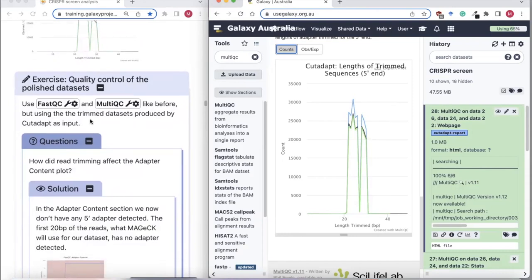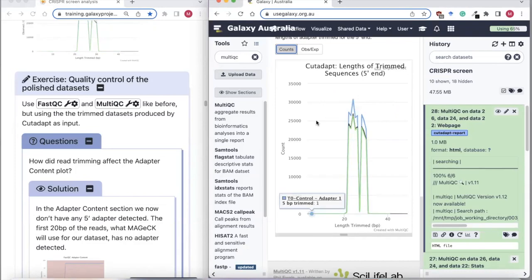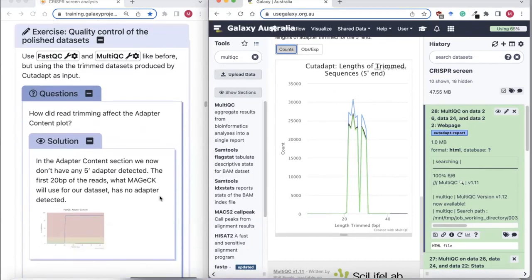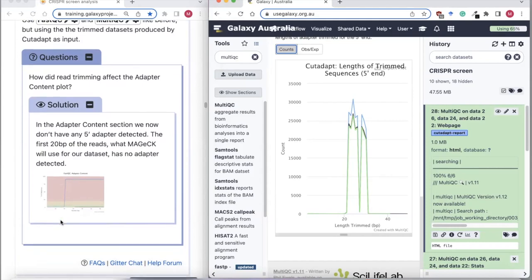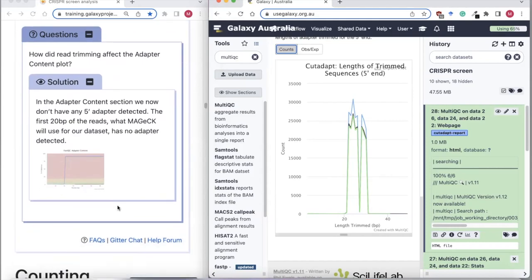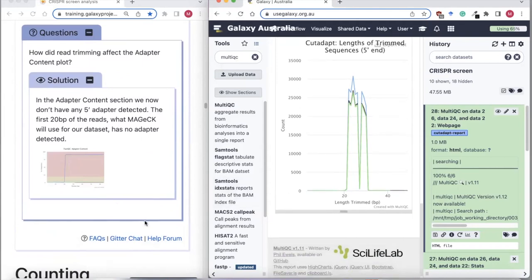If you want, you can go on and run FastQC and MultiQC again on the trimmed dataset — the output of CutAdapt — just to see how the trimming affects the adapters. You should see that there's now no CRISPR adapter present in the first 20 bases of the reads — it's been removed.